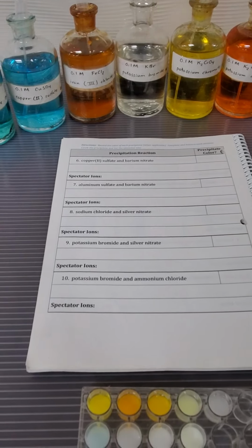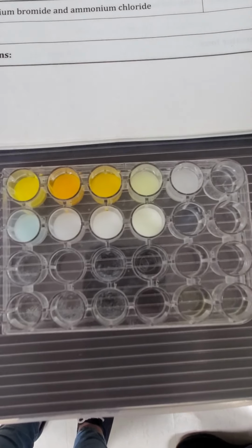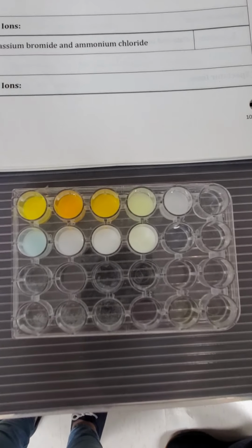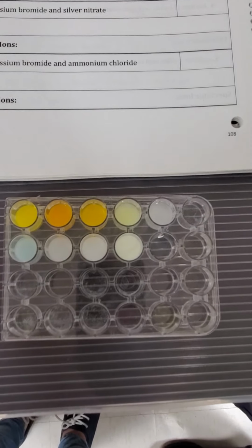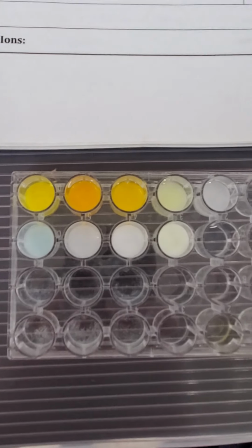And ammonium chloride. Two clear solutions. And notice nothing happens. So sometimes double replacement reactions don't work, and that's because everybody is a spectator here in number 10. So take a few minutes to record your observations, and then we'll move on to the next page.